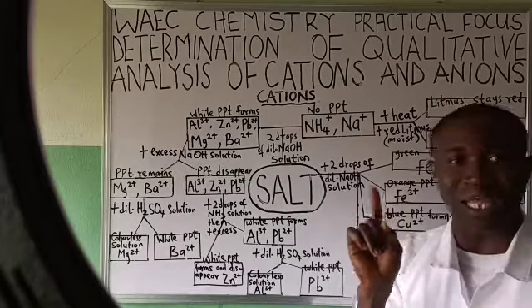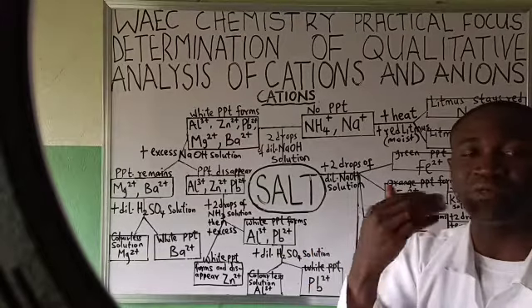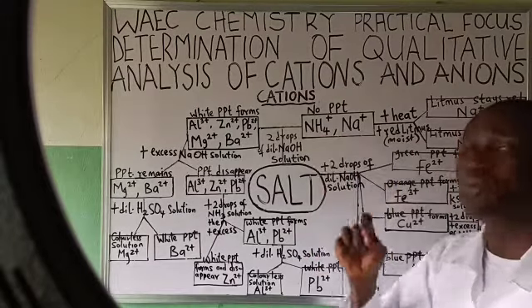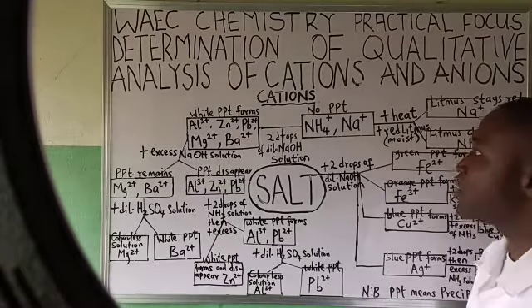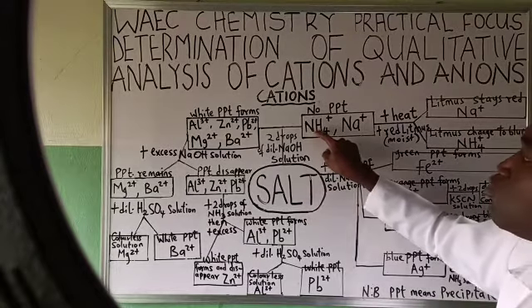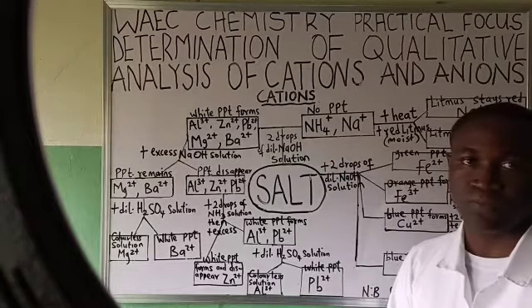Also, group 6 cations are very soluble in water, and that is why group 6 cations do not have precipitating reagents or agents. So, group 6 cations, ammonium ion radical, are very soluble in water. So, when it is very soluble in water, know that you go and look for tests for this, to know which of these is in your salt.